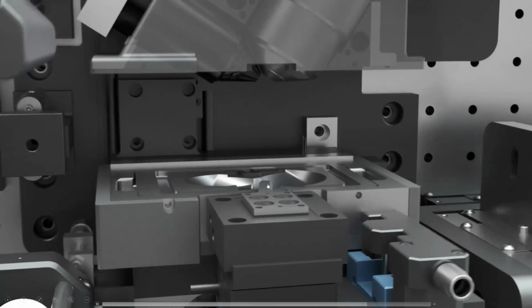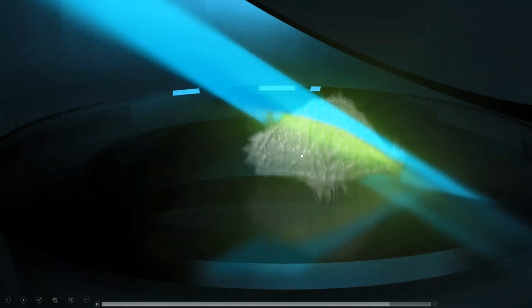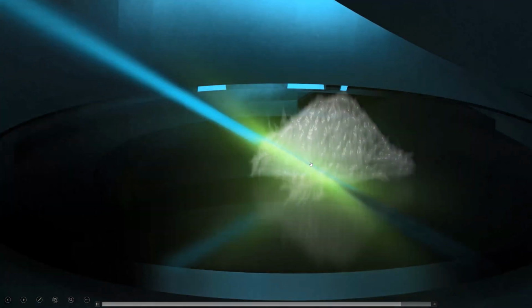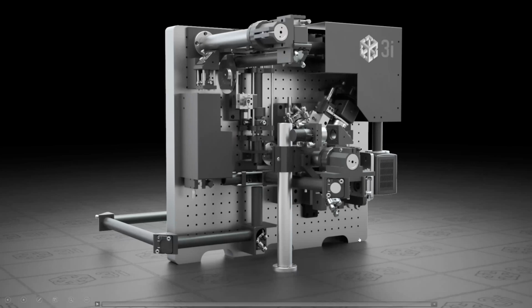It is going to zoom into where the sample actually sits, and I'll show anyone who comes by for the tour, obviously this in person, but there is a little 5mm cover slip that sits right here, and a gratuitously large cell in this animation to highlight roughly proportionally how thin the sheet is as it goes through the sample. Obviously not drawn completely to scale because I want people to be able to see this, but you have that little cover slip there. So I know that's very quick, and I can go over this again to anyone who shows up for the tour, but that is how it works.